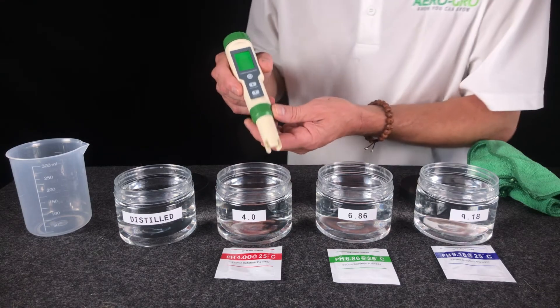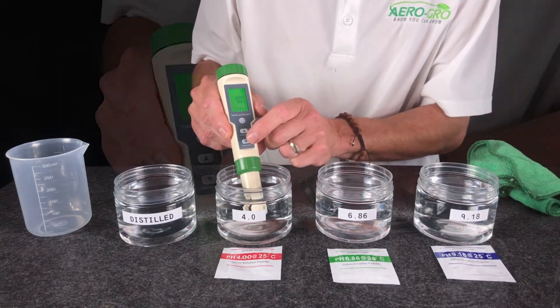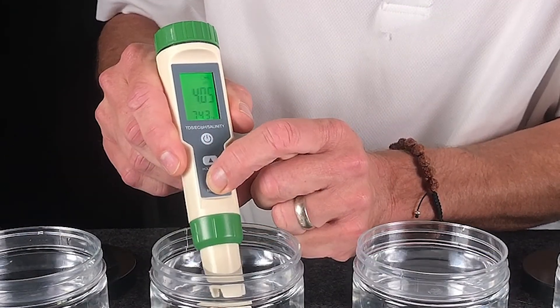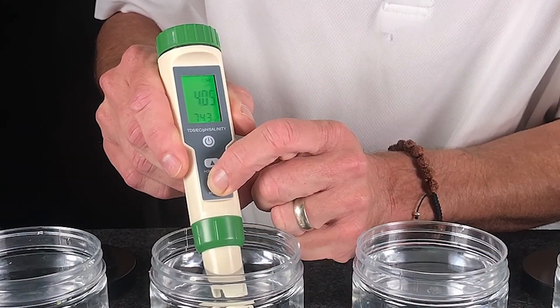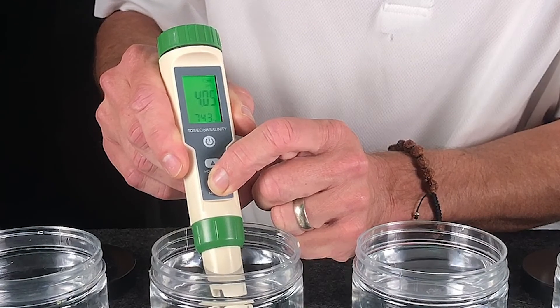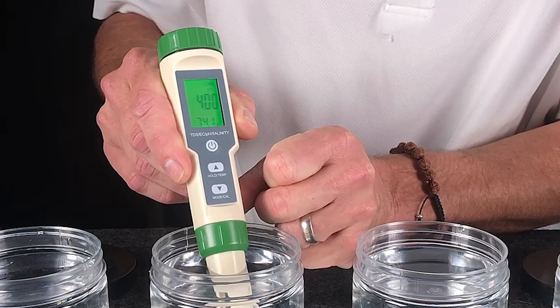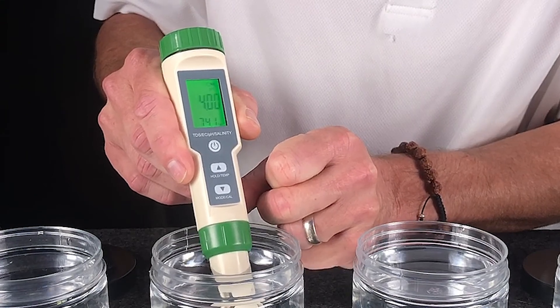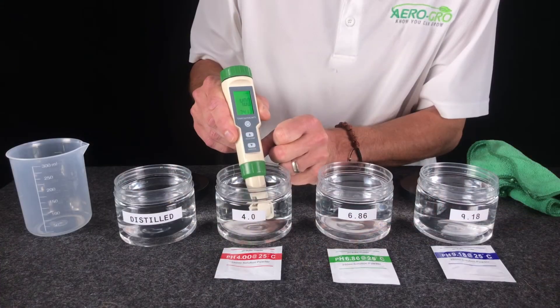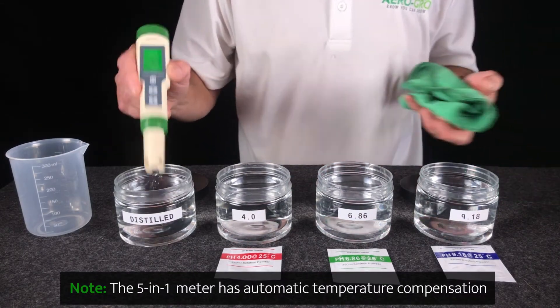To begin, start with the 4.0 solution. Dip it into the 4.0 solution and press the calibrate button — hold for a count of five, then let go. It's calibrating, and when that stops blinking it will be done. 4.0, right on the money. Rinse it off and move to the next.